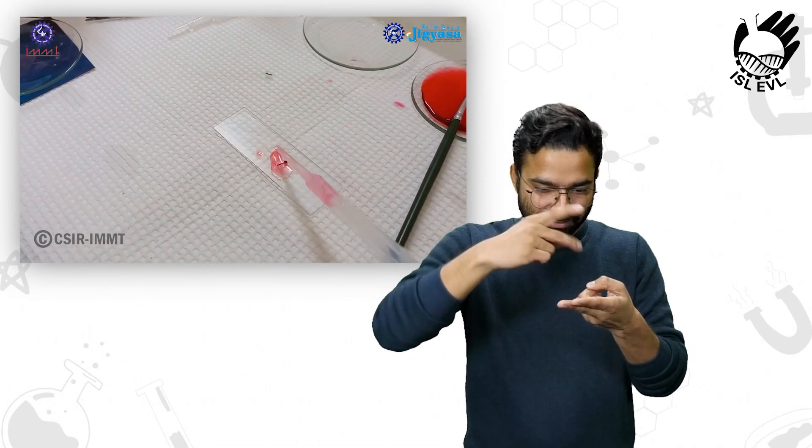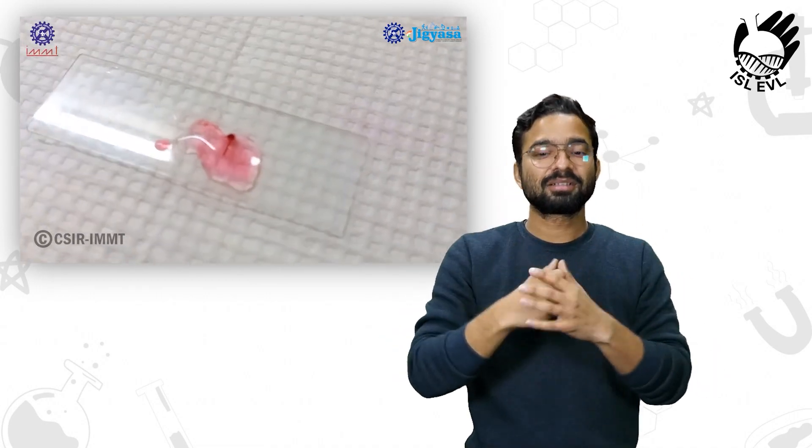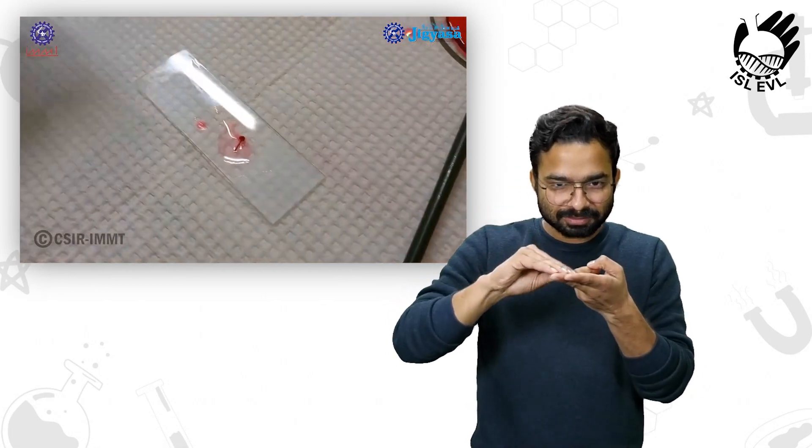Then we will wash the stain with water and clean the slide. If there is excess water on the slide, we can use filter paper to get rid of it.